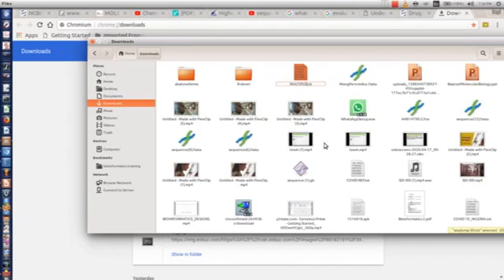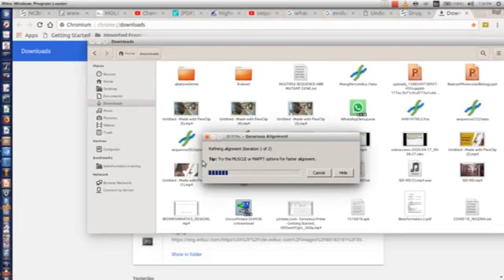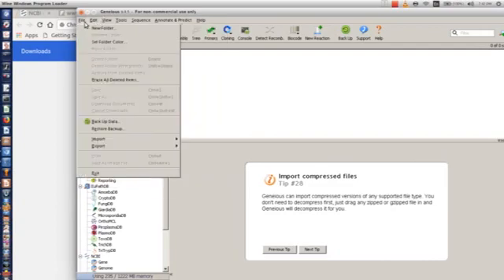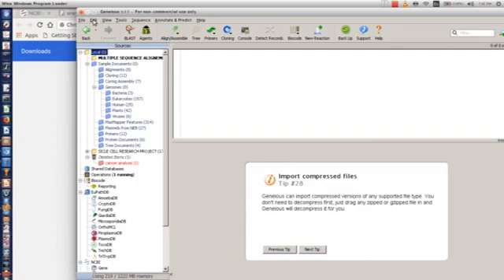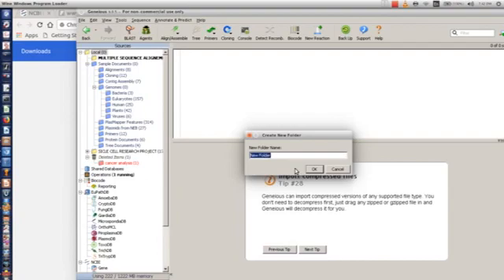Here it is, and you rename it to multiple mutant gene, and you save. As soon as you're done, you cancel and go directly to your Geneious software. Then you create a new folder, which is multiple sequence alignment, and you click, and you create another folder, phylogenetics analysis.